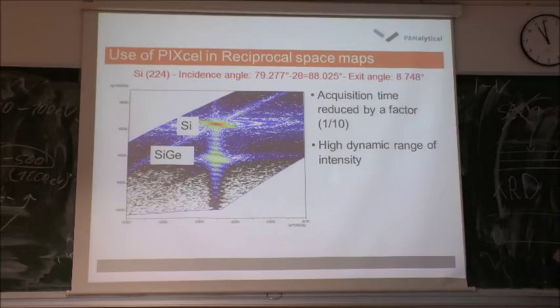In this case, a beam has a certain width, and if you shine on your crystal at high angle, then you get a quite thinner signal which is going out. This thinner signal is then better for the analysis of your sample. So here you see that by proper decision of peaks which are analyzed, you can further improve the resolution. But nevertheless, these acquisition times are quite high. Let's say for this kind of image, you need the whole night.